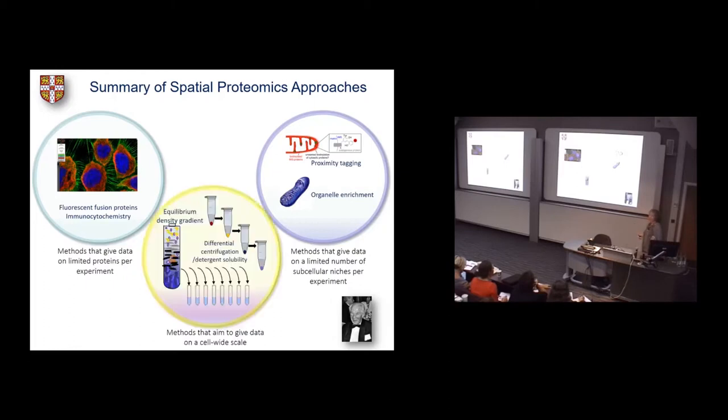And he argued that there was no point trying to carry out purification of organelles and subfractionation of different niches, because you were never going to get anything pure. So he argued if you carried out biochemical fractionation of cells, then what you could do is to look at the distribution of proteins throughout these fractions, and if you knew that you had a marker for a particular location, then any other protein that was showing the same distribution, you would assign to the same location.